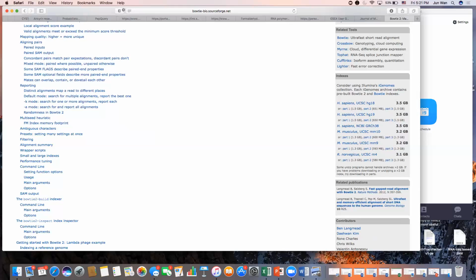Now, those are default settings. Okay, what I've just told you there about Bowtie 2, K4, X2000, P9, local, those are all default settings and they work beautifully. They really generate a great SAM. You can add more, you can change more, you can take things out. What changes is computation time, right? So how efficiently and how fast you move through things. If you want to change the number of reads, you can change that, okay? And there are many, many, many more things that you can do. Again, there's an entire manual written on one code. So one line of code, many options that you can add and change. I encourage you to study this program because it's a great aligner, and ChIP-seq is becoming so commonly used, you may want to get familiar with Bowtie 2. Okay, but be very careful when you build your indexes.